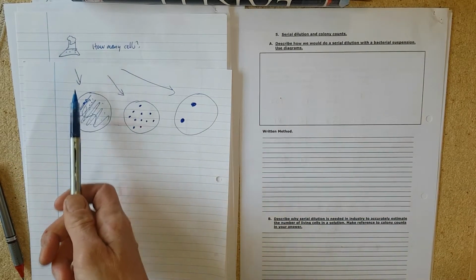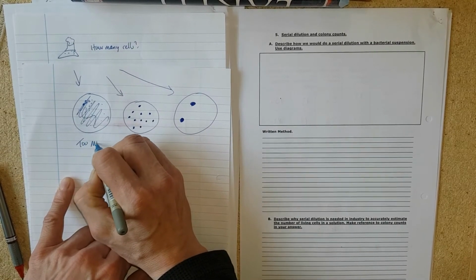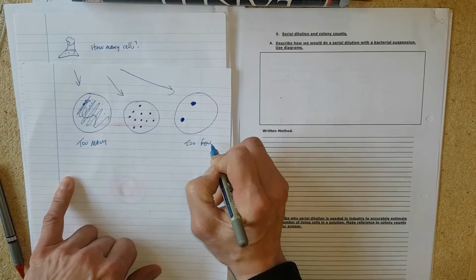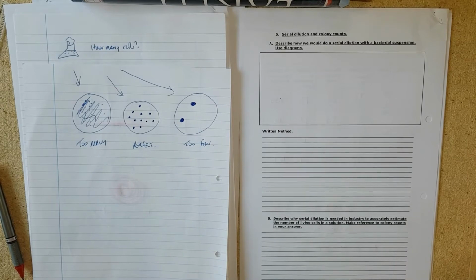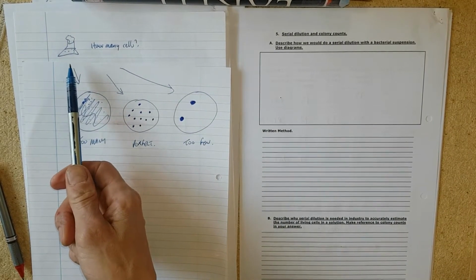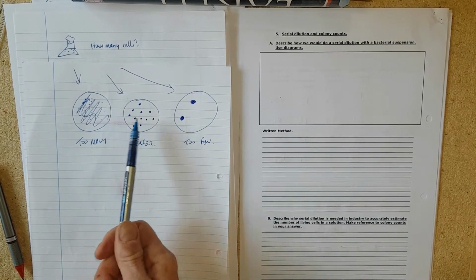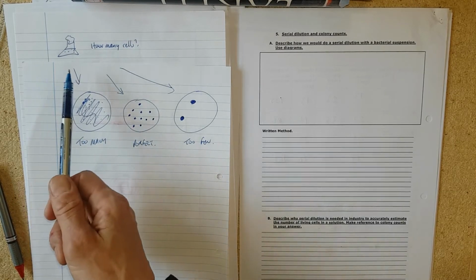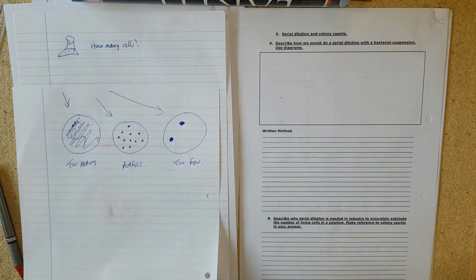So that's the best sort of count. But our culture might have this one where there's too many cells, this one where there's too few, or it might be perfect. So what we need to do is set up some dilutions of this culture so that we can get this plate. We don't know how diluted we need to make it. Do we need to dilute it by half? Dilute it by 10 times? Who knows?